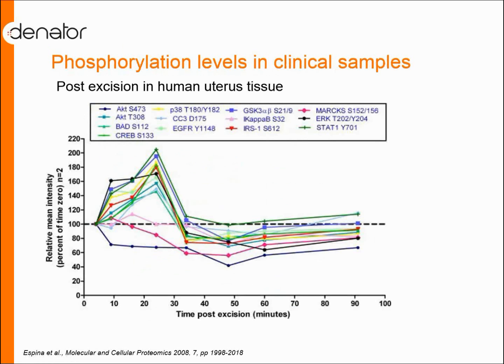If we look at another study, we did the first phospho study. This study is by another group that we're not working with. I'm just including this to show the complexity of studying phosphorylations. The experimental setup is pretty much identical.